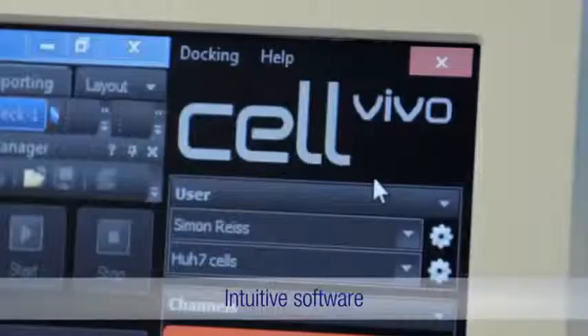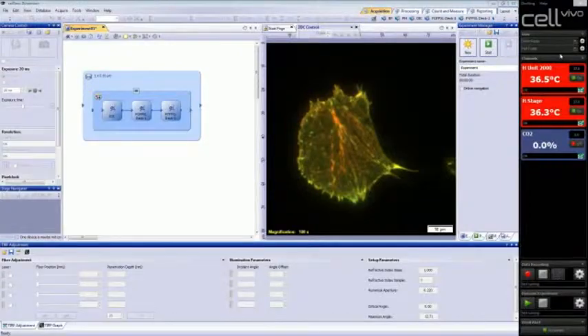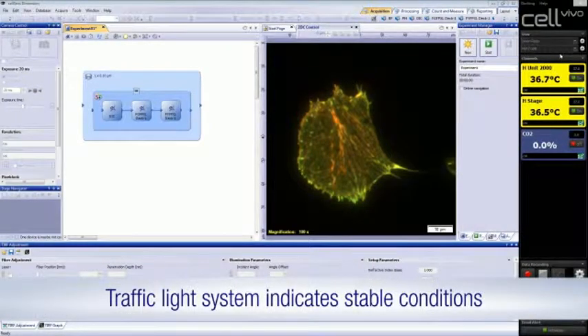Cell Vivo's user-friendly software also introduces the unique traffic light system, which lets you know when imaging can begin in a stable environment — a crucial factor for live cell imaging.